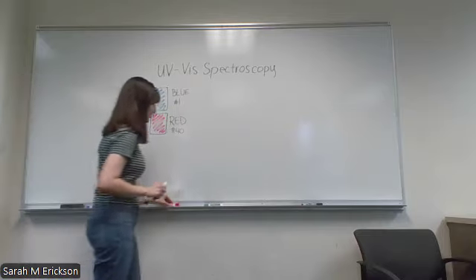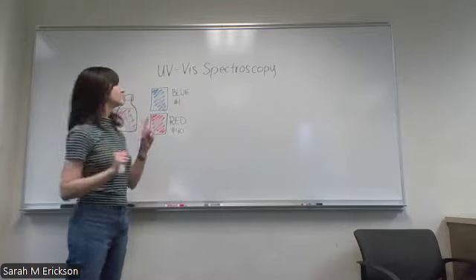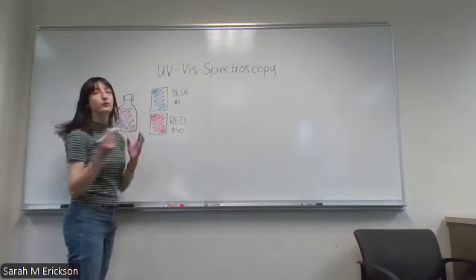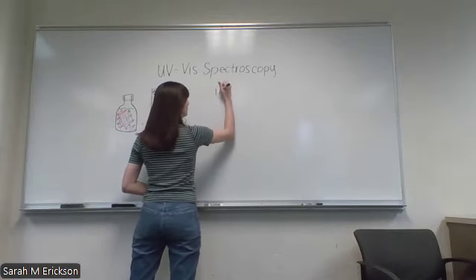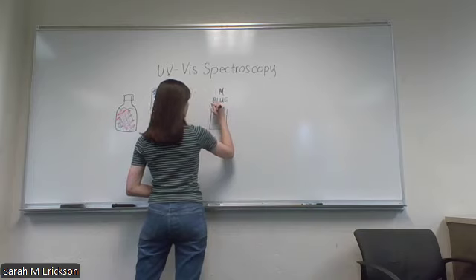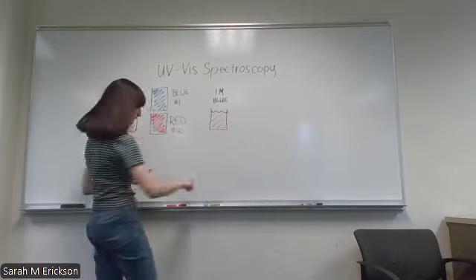Okay, so I'm going to walk you guys through how to make calibration curves for one type of dye. I'm going to do this for the blue dye. You'll do the same thing for both. So let's say we make a solution of 1 molar blue dye. So we have a solution of blue dye and it's 1 molar. So maybe it's like a slightly faint blue.